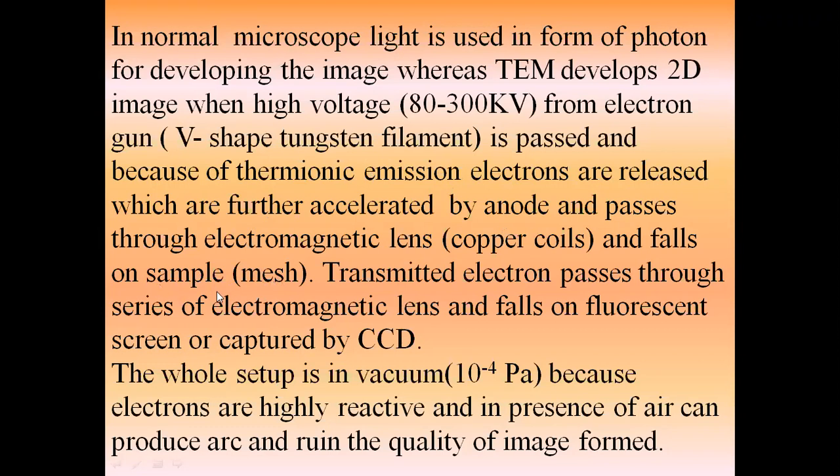This sample is kept on a mesh. The mesh is like small filters, of different sizes and different shapes also.